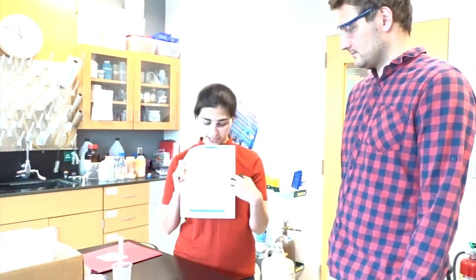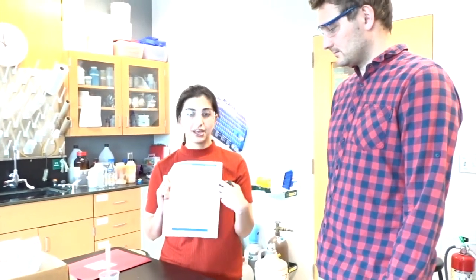Now that the students have done their first reaction with a solid tablet, they can repeat that experiment twice, so they get 3 sets of data. This will teach them the importance of replicating their data to see if the result they see is actually real. And once they've recorded those 3 different times, they'll have an opportunity to average that time for the solid tablet and also note observations in the results table. So now we'll move on to the crushed Alka-Seltzer tablet.